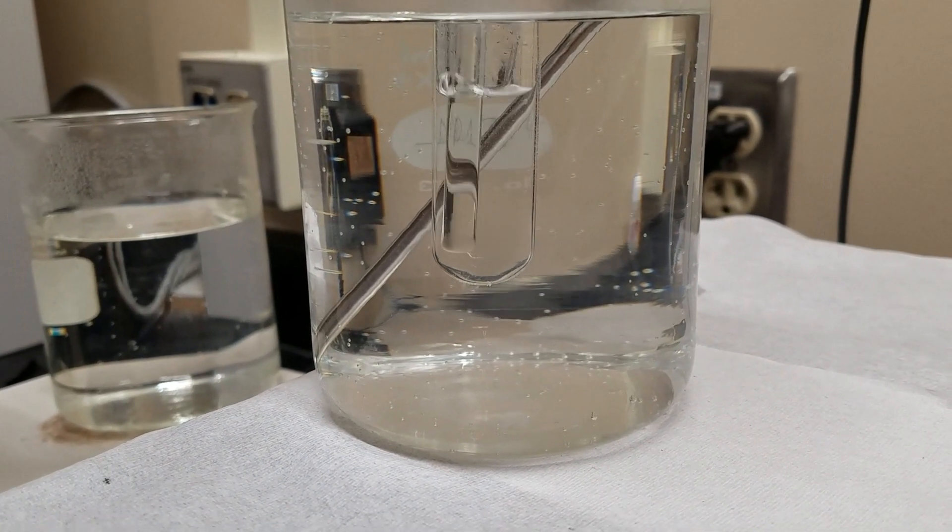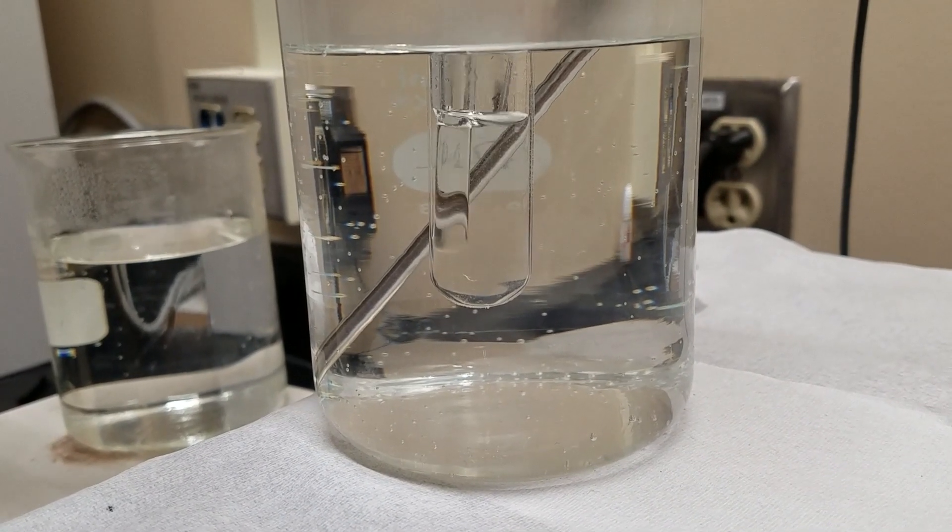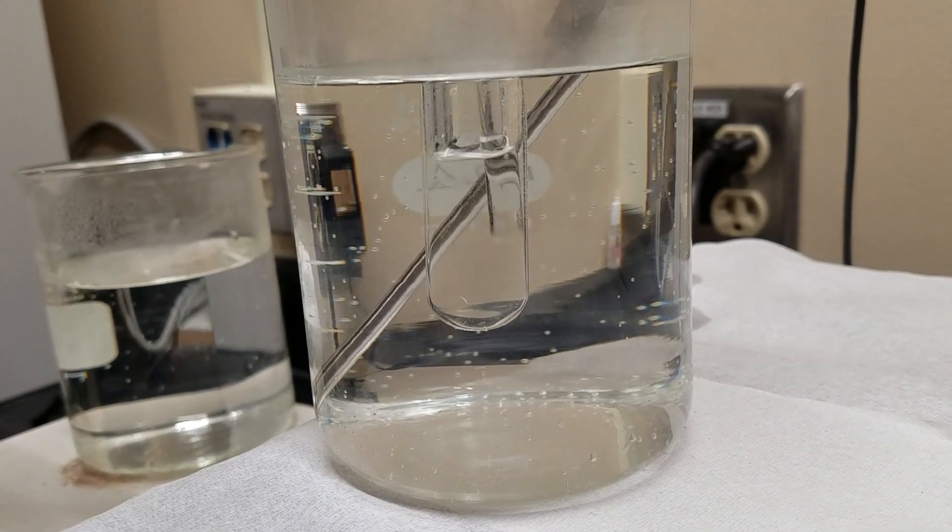When the solution gets cool enough the potassium nitrate will reach supersaturation and it will start to precipitate. You'll need to watch closely because it happens awfully fast.